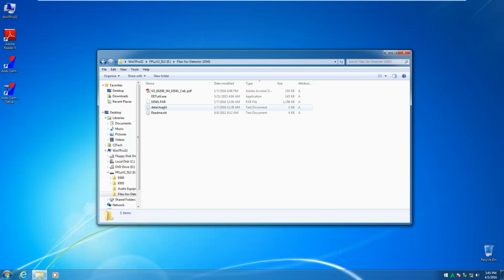To ensure accurate ISOCS and/or LabSOCS efficiency calibrations for a specific detector, a unique ISOCS LabSOCS characterization file for that detector must be obtained from Canberra and properly installed on the system computer. Each detector-specific characterization file has a .par file extension and is commonly referred to as a PAR file.